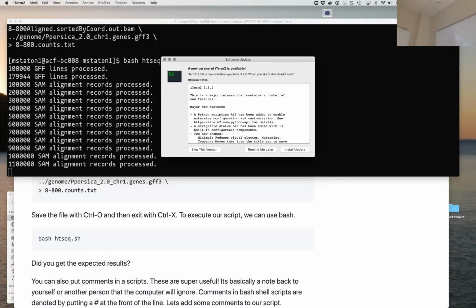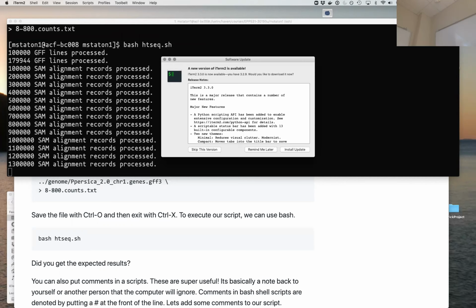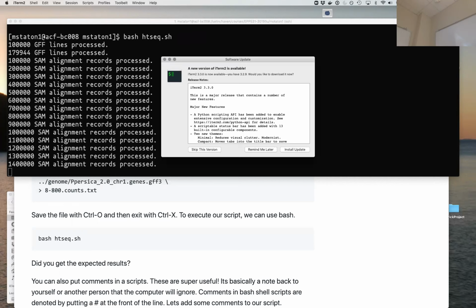And so you can imagine having a script that outputs the QC, does the trimming, does the mapping, does the counting, and does it all in one long script. You walk away from the computer and it's just done really fast. The danger of that is to make sure that you're looking at the intermediate files. If something fails, you're asking, what step did it fail at? You have to go look at each of the output files to figure out where things went wrong. But it's much more convenient to do it that way over the long term as you get more and more familiar with your software tools and you know what you want to do with them. You can shove all of that in one file.